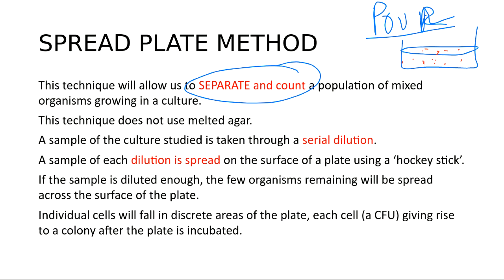Disadvantage of that is you cannot get to the organisms that are embedded inside the agar. You cannot physically grab them if you wanted to do that. Disadvantage number 2, you're pouring melted hot agar onto your bacteria. If the bacteria is heat sensitive, the heat of the agar may kill it, and you end up with less organisms.